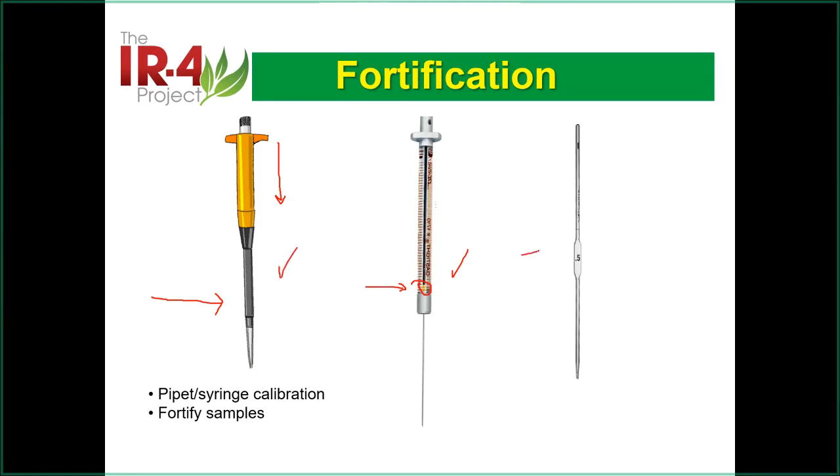And another one is to use a glass pipette. That's the best one because if you don't break the glass, you don't change the glass, for example, you don't put it in the oven to dry, it's fine. So in this case, the glass won't change. And as long as you use verified, typically what we call class A, then it's verified for this level.